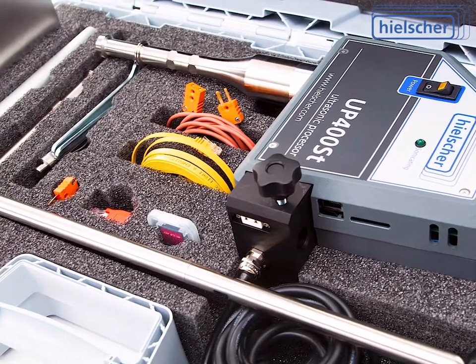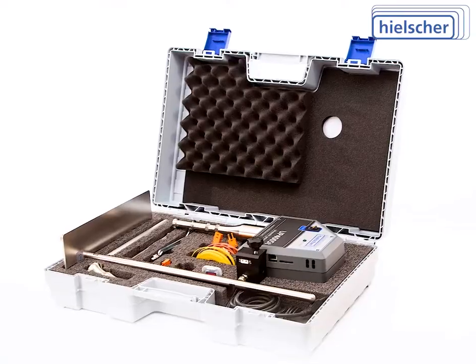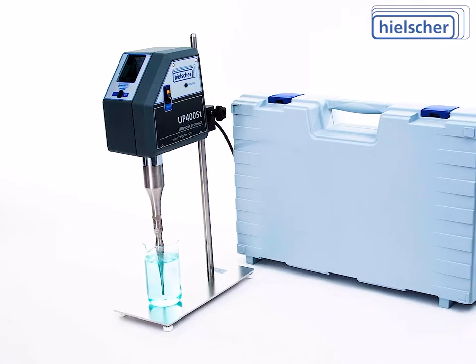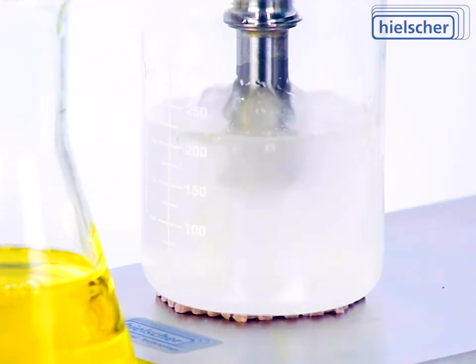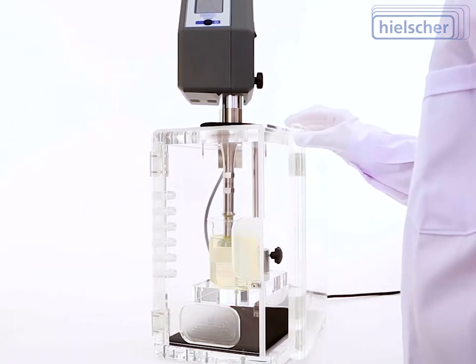The UP400ST comes ready to run in a robust transport and storage case. It's readily available and in stock in our German and U.S. warehouses, as well as from our worldwide distributors. Hielscher offers the best after-sales service. Our technical team will be glad to support you in video conferences to walk you through the setup and first sonication runs.